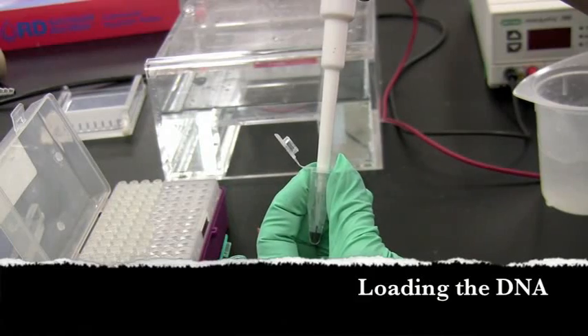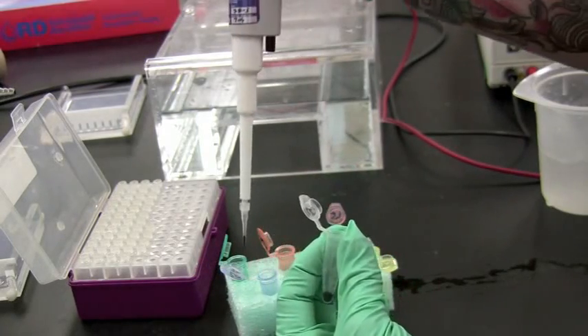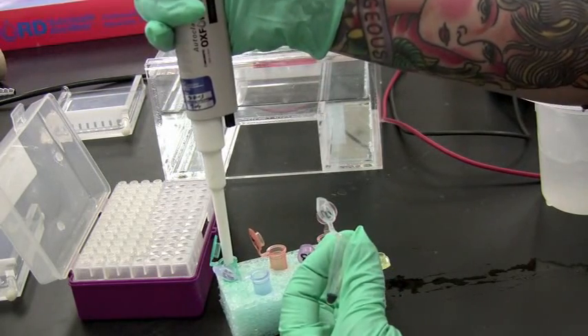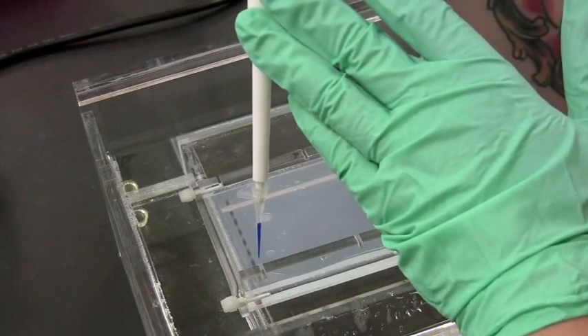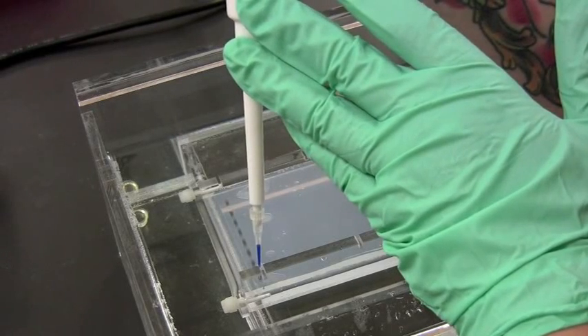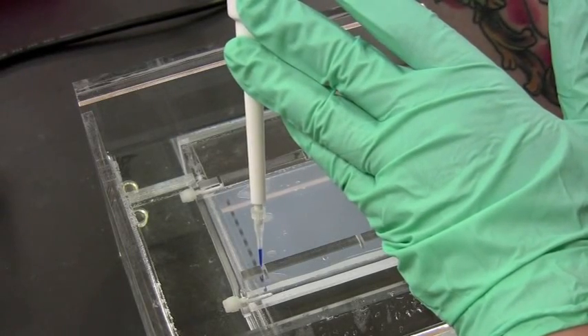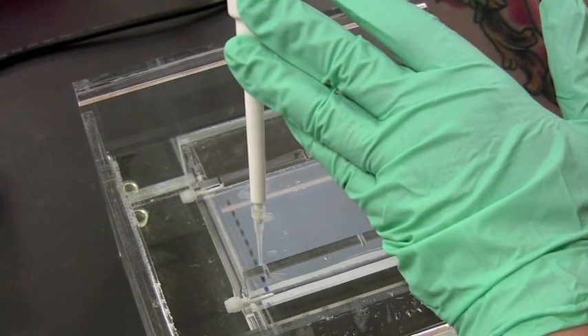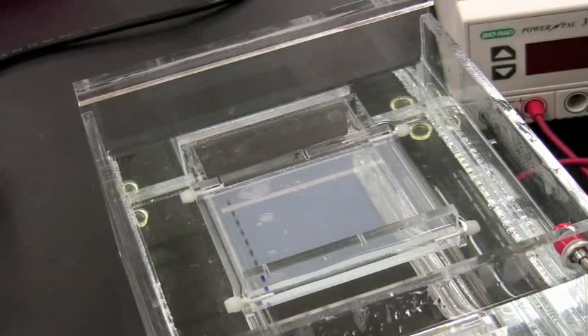To help visualize the DNA and make it more dense, a loading dye containing a dye and a sugar is added. Here, we are using 5 microliters added to each DNA sample after digestion. Pipette the desired amount needed to load into each well. Keeping steady, go inside the well but do not pierce it, and expel the DNA.